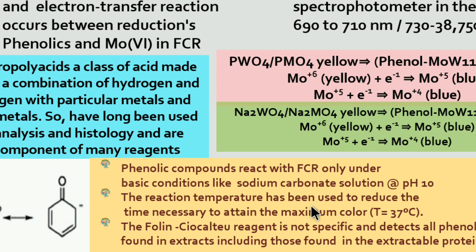If you are going to use this particular reaction temperature, if it is mentioned like 25 degrees centigrade, 37 degrees centigrade as mentioned here, and also in some papers and some procedures it is mentioned as 40 degrees centigrade. That is the maximum seen in every paper and manual, that 40 degrees centigrade is the maximum temperature used. Because of that, the time is going to reduce to 15 to 20 minutes, depending upon the amount of the sample you are using.